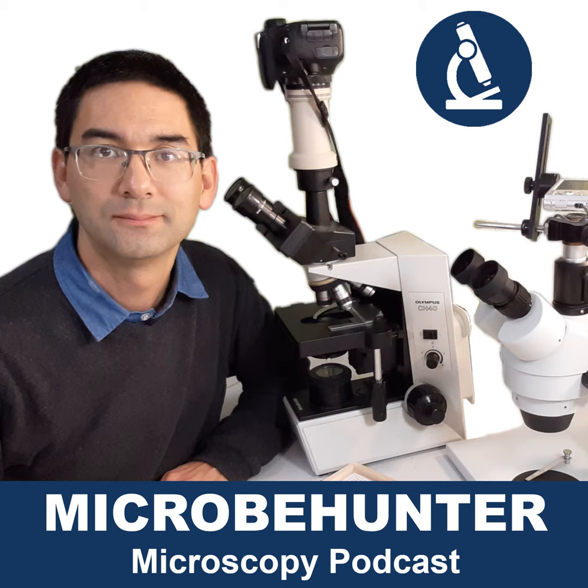So for this reason, I have to do something to the paper clip to be able to observe it. Actually, there's not much I can do. I have to grind it up maybe, so it's small enough that I can look at the small metal filings under the microscope. But I cannot look at the whole object under the compound microscope. So you see that different specimens are really suitable for different types of microscopes. And this is the reason why, when you want to buy a microscope, that's the first thing they're probably going to ask.